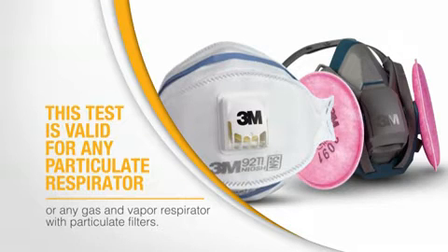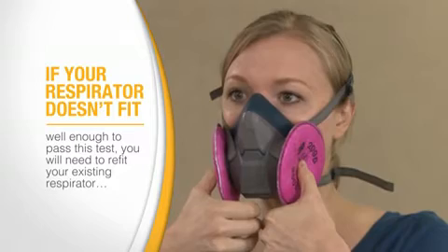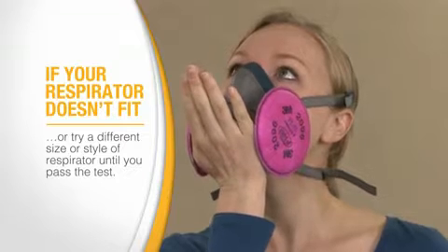This test is valid for any particulate respirator or any gas and vapor respirator with particulate filters. The particulate filters are used so that only facepiece fit is tested. The qualitative fit test must be repeated at least once a year to ensure that your respirator continues to fit properly. If your respirator doesn't fit well enough to pass this test, you will need to refit your existing respirator or try a different size or style of respirator until you pass the test.